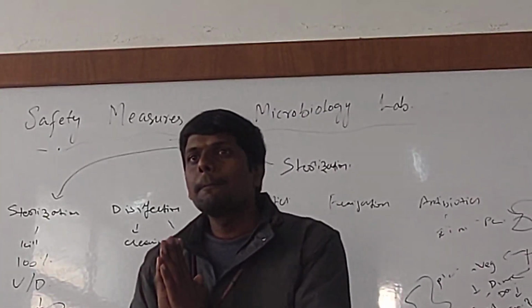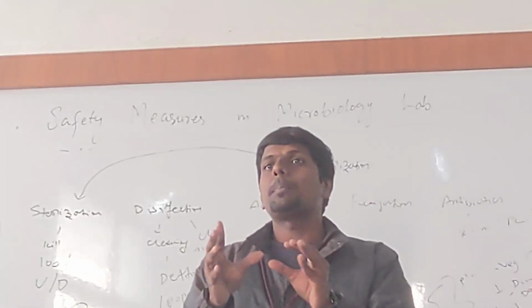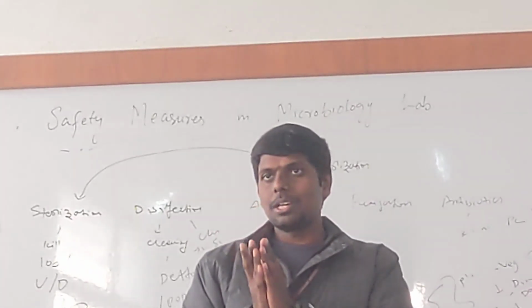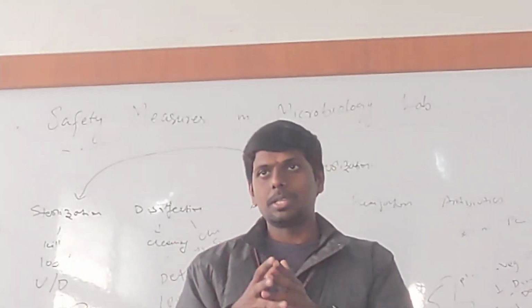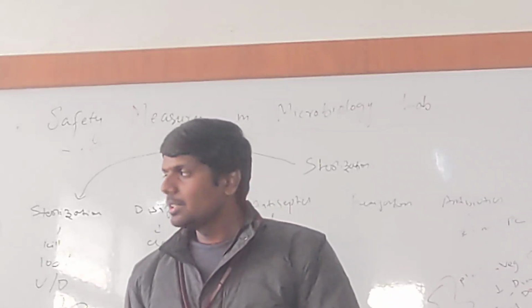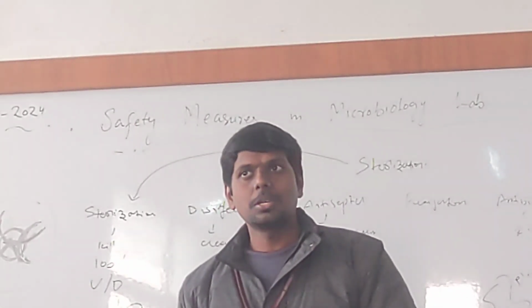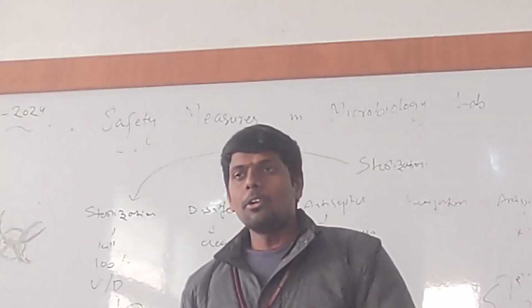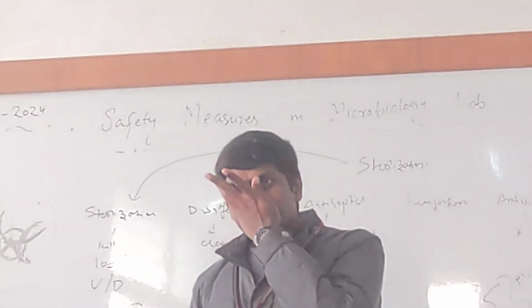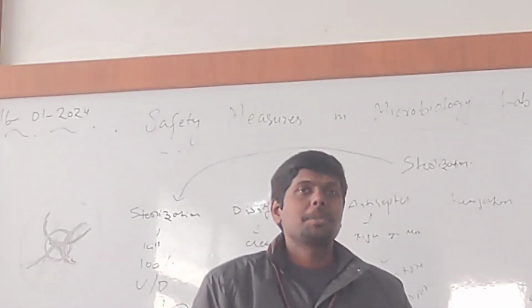So what is fumigation? Subjecting to gaseous vapors is called fumigation. I will give one example of fumigation. What example can I give? Simple fumigation. Have you smelled formaldehyde? No, right? Formalin. You don't know.